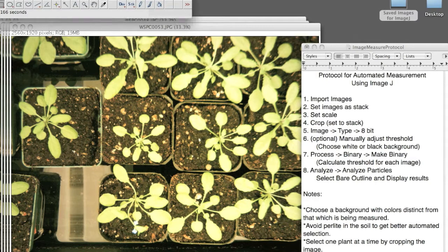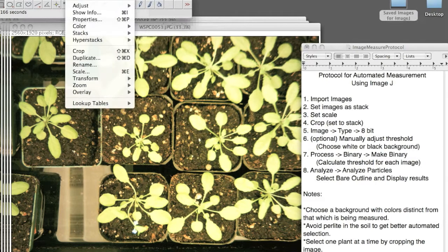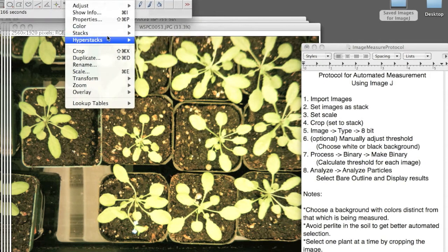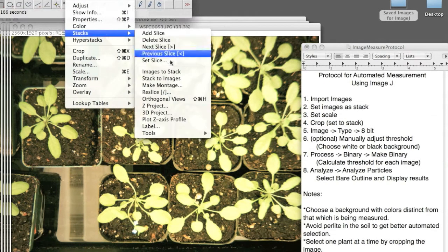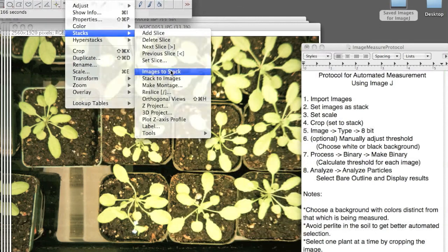Next, you want to set the images to a stack. You do this by going to Image, Stacks, Image to Stack.